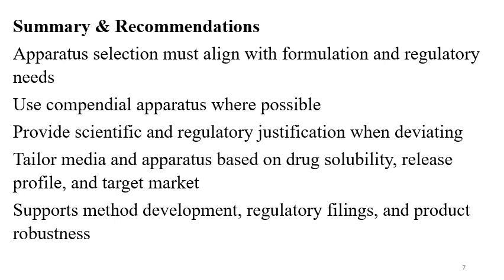As per my current understanding and experience, whenever you are going to develop a dissolution method, consider the product as a global market product and go through all the required guidelines and then select the apparatus.